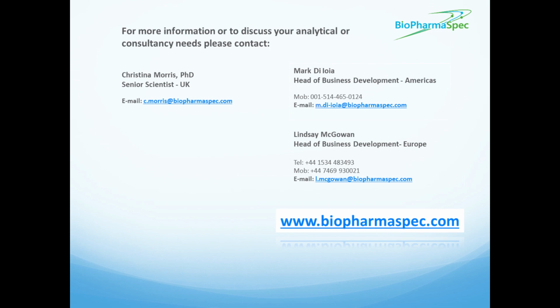Again, if it's different lots of the same product, in general terms, one lysate library might be fine, as we wouldn't normally expect large changes in the HCP profiles from batch to batch. But you would still need to closely monitor for any changes, or for example, a deviation to the extraction process, which might necessitate reanalyzing the host cell lysate and the library.